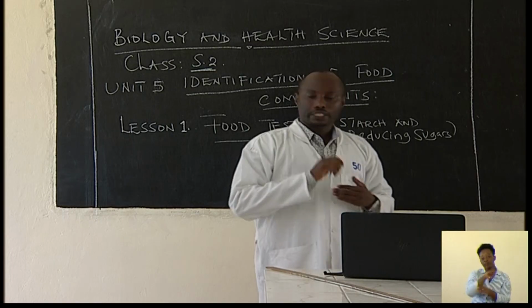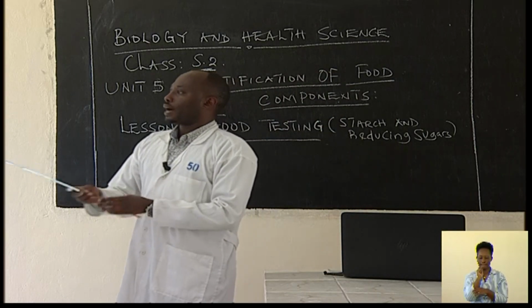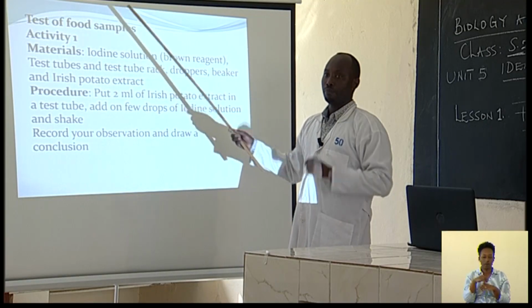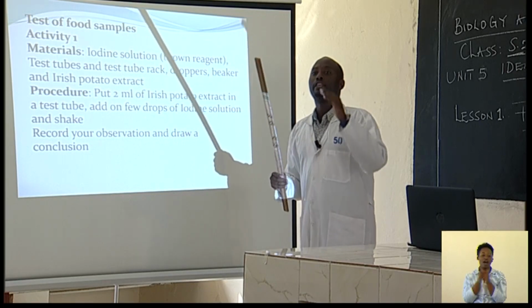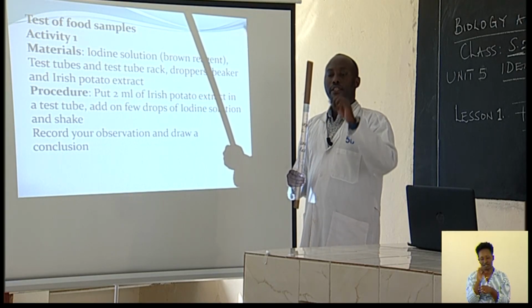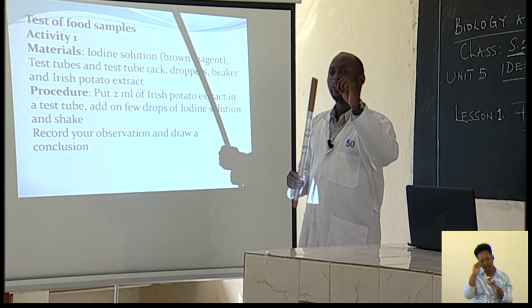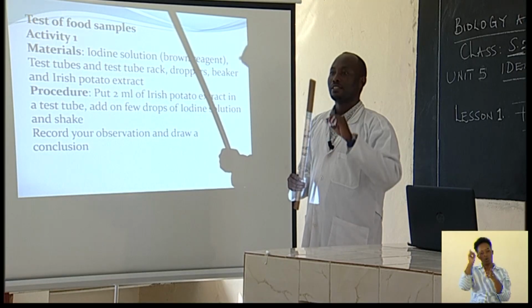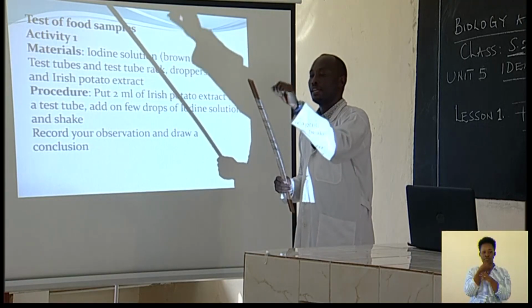Another question, student, is testing of a food sample. Number one, I will be doing activity one. We have to test for starch. I said we're going to test starch. What indicates that the food contains starch? Student, think about it. After thinking about it, what can we use? What are the chemicals and apparatus that are going to be used to test if the food contains starch?